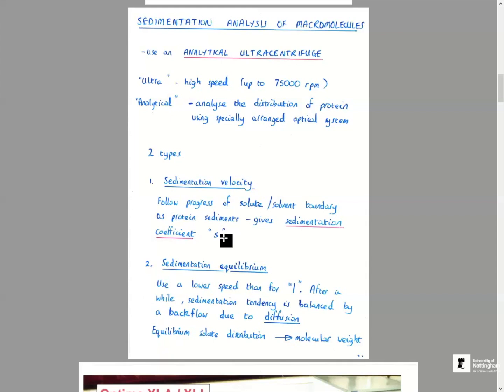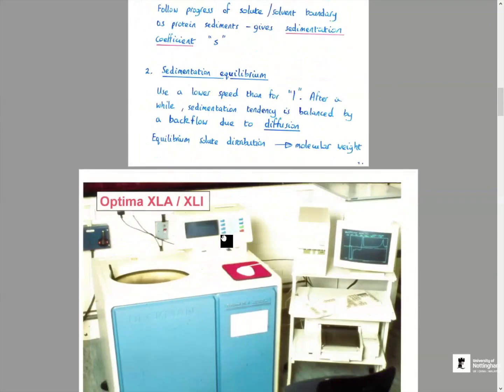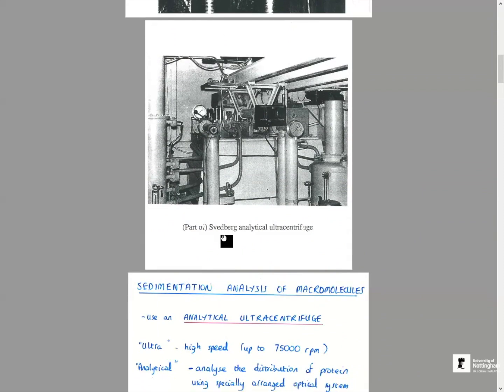So it's a very, very powerful method, which works beautifully in conjunction with electrophoresis, as I'll show you in a minute.